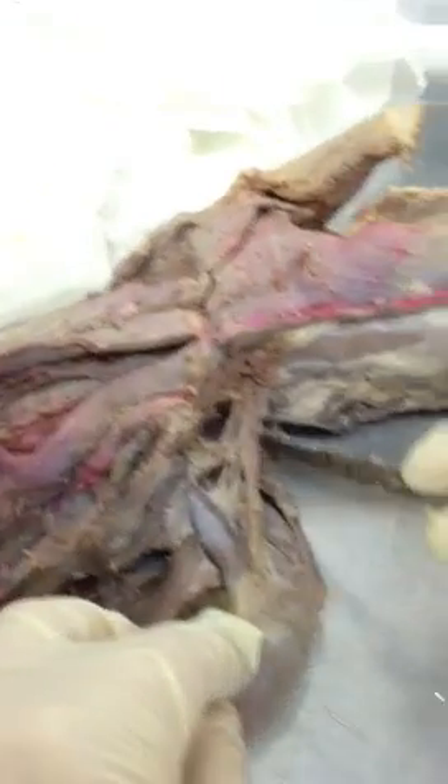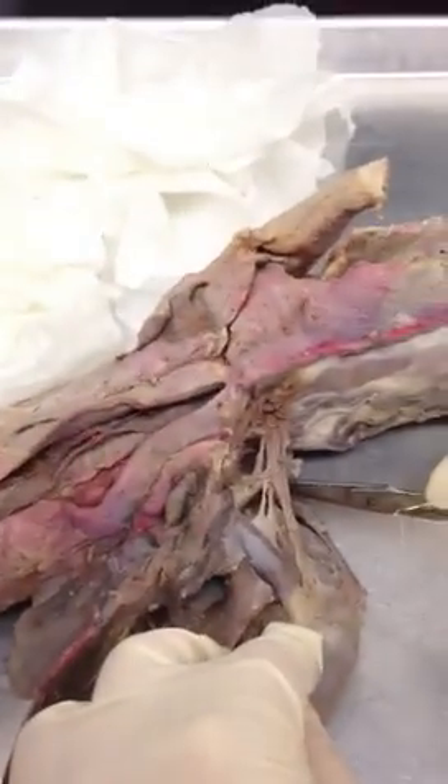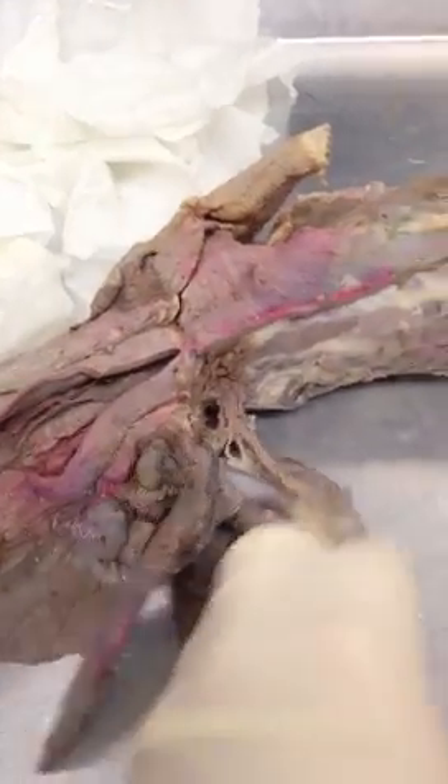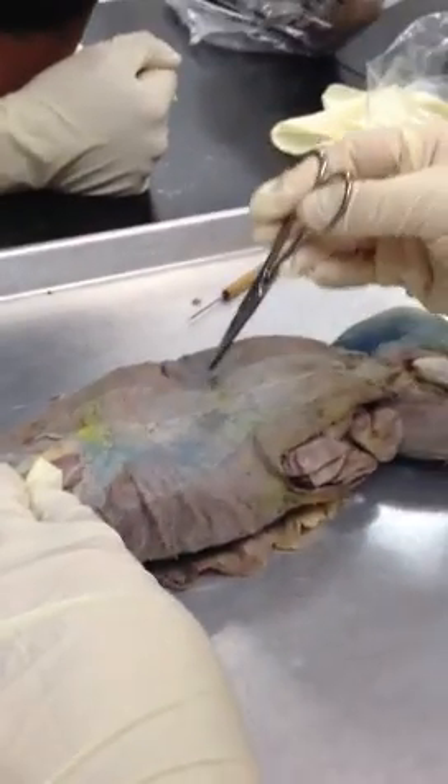Right in here would be teres major. But the 220 lab doesn't dissect those out, so they're a little bit different for you guys. Next, you can see right down the very center here — rectus abdominis. And just here — external oblique. I don't make the little window for the internal oblique, so there's a difference between the different lab sections.